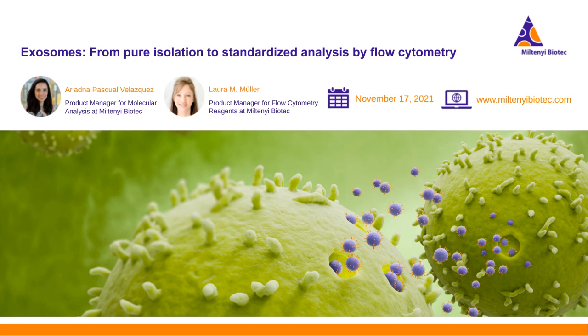So it's not required. You can simply lyse the vesicles bound to the beads and then perform the gel separation, and then do the Western blot. The beads would stay in the pockets of the gel, so they do not interfere with Western blotting. The other possibility is to lyse the vesicles on the column and then do the elution within the magnet. Then the beads will stay on the magnet, and again, you can run the gel for a Western blot and do the analysis. So there's no interference of the beads with the downstream analysis using Western blotting.